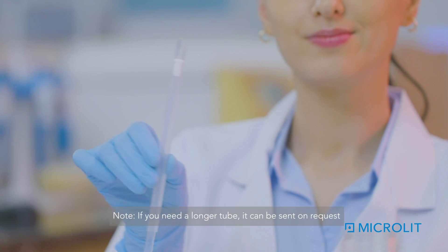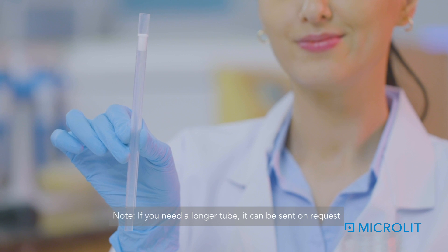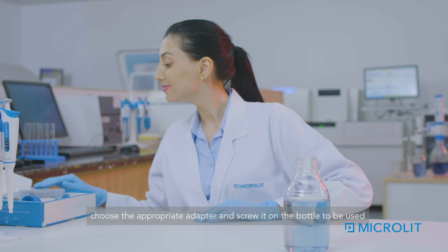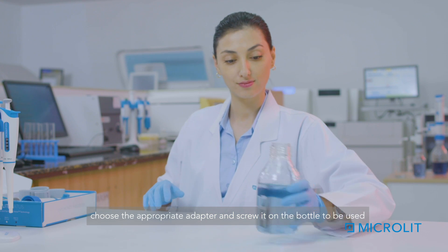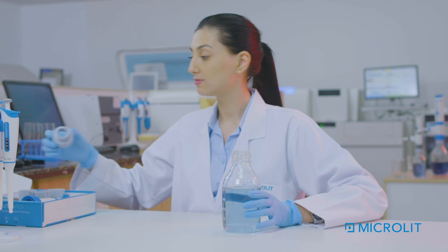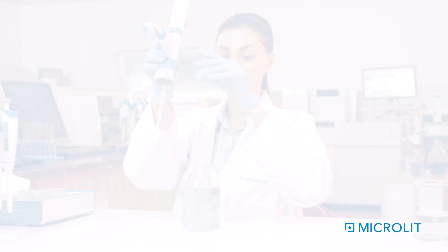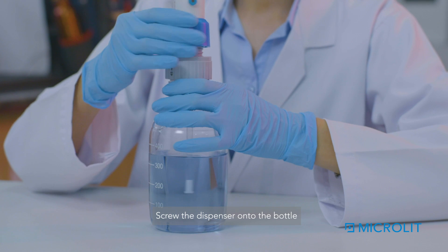Note: if you need a longer tube, it can be sent on request. Out of the five available adapters, choose the appropriate adapter and screw it on the bottle to be used. Then screw the dispenser onto the bottle.